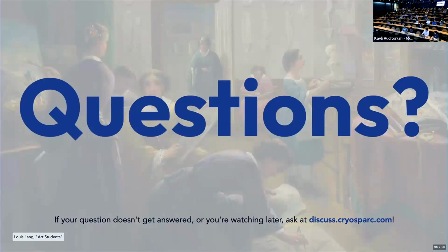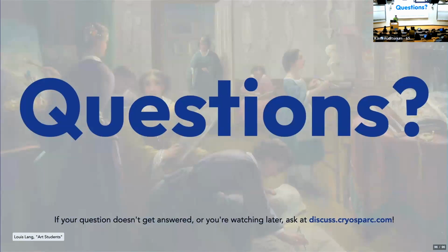Yeah, no, it's a good question. How do you pick the classes, given all these different problems? I think your point is exactly right. Ideally every particle is different, so you'd have 1 million classes, but then you lose the benefit of averaging them together. So you're always trading off the resolvability of your class, not formal resolution, but how much can I see what this is, against how high quality the signal to noise ratio is. And by the end of this workshop, you're going to get tired of me saying it depends on the sample, but unfortunately it depends on the sample.